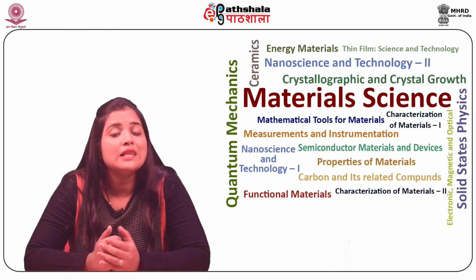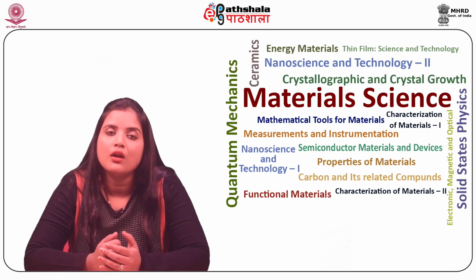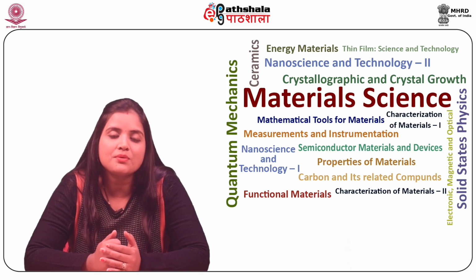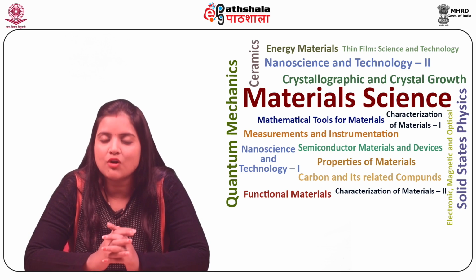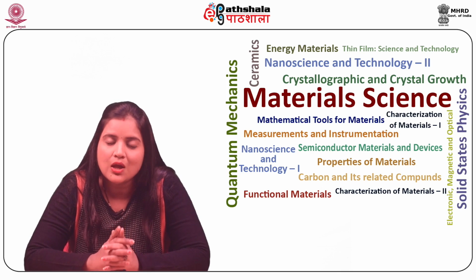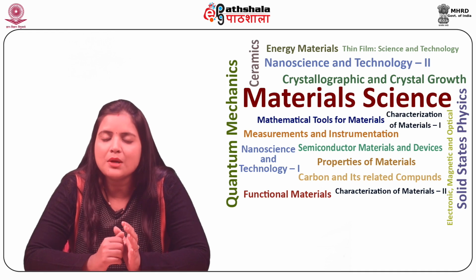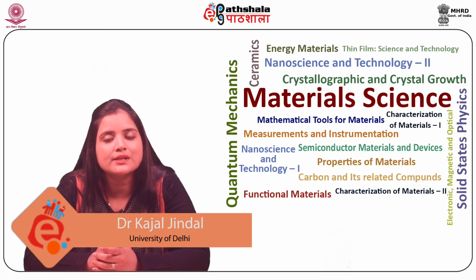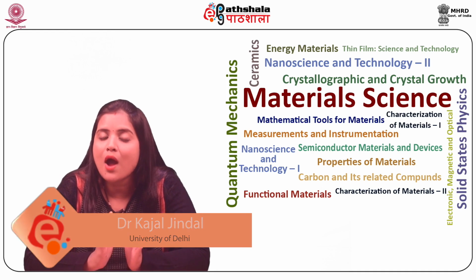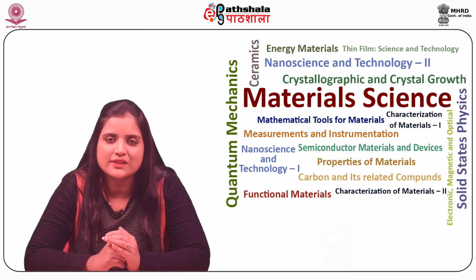So students, let us now summarize what we have learned in this module. In this module, the concept of digital holography microscopy was introduced. Then, the working principle of digital holography microscopy was discussed. The primary problems in signal processing in a holographic display were discussed. Finally, the advantages and applications of DHM were studied.